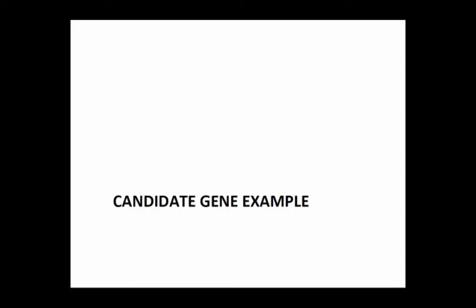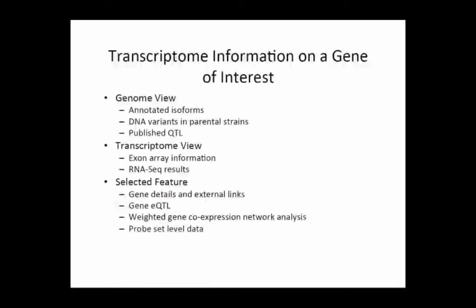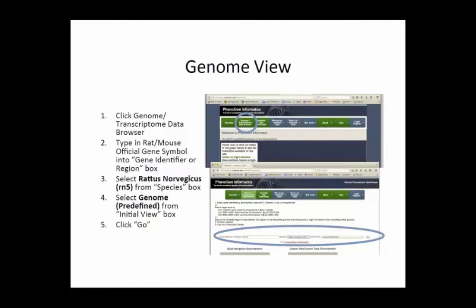So is everybody logged on and ready to go? You don't need to register. That's the nice thing about this particular tool. We're going to go over a genome view and talk about some genome details on this interactive viewer, and then we'll talk about some of the transcriptome information, and then get down to what we call a selected feature and go into some detail there.